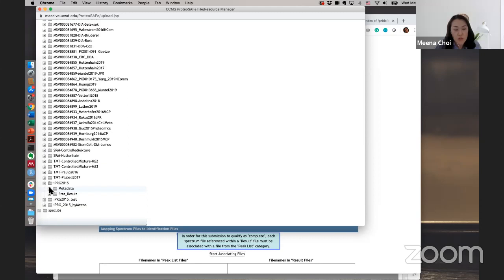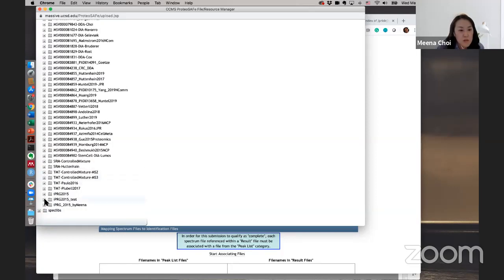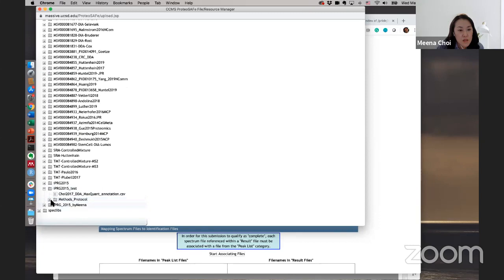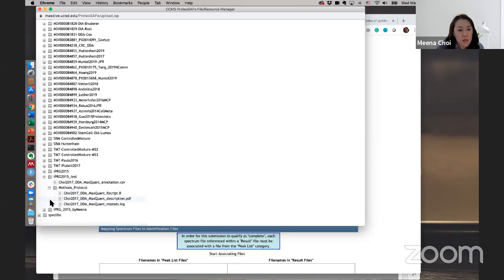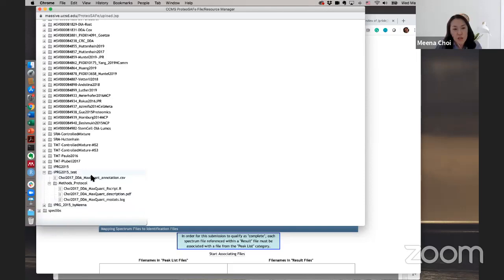And then here you can see, oh, this one probably the wrong one. Yeah, I tested several times. So, okay, so this one. So you can find my file, what I uploaded. So for example, here, this is annotation. So I have to click this annotation, click.